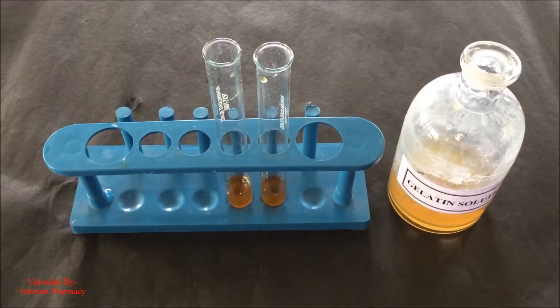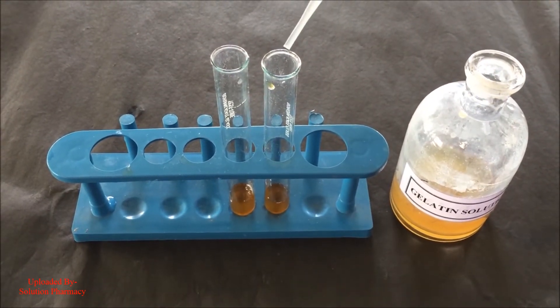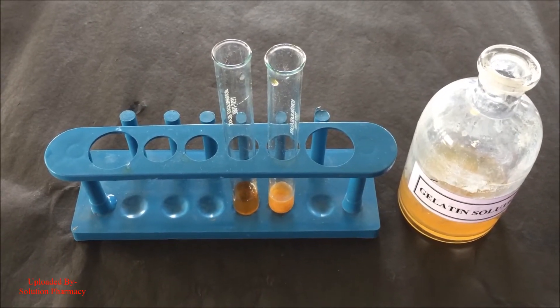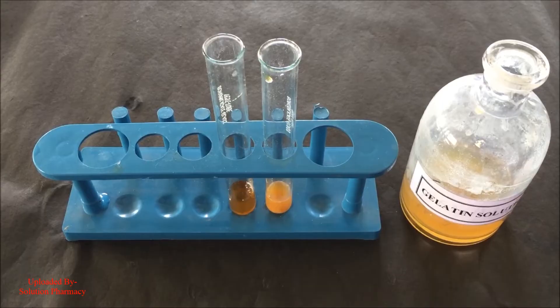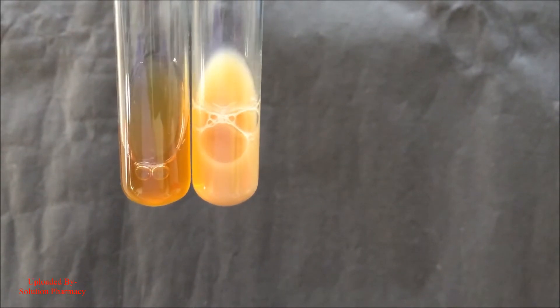Now we are going to perform the second test, that is the gelatin test. Add few drops of gelatin solution to the one test tube and compare the changes with the second test tube containing aqueous extract of the green tea leaves. The formation of white precipitate indicates the presence of tannin in the extract.